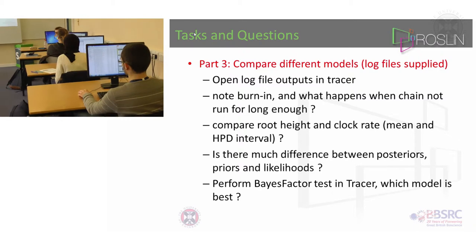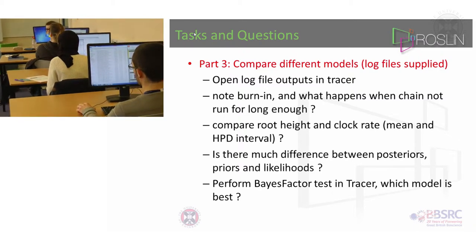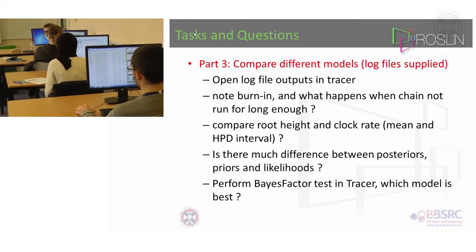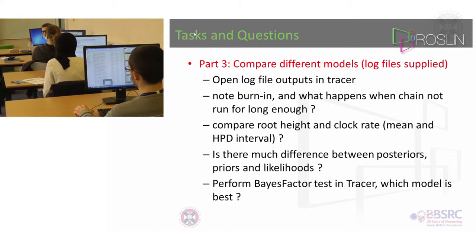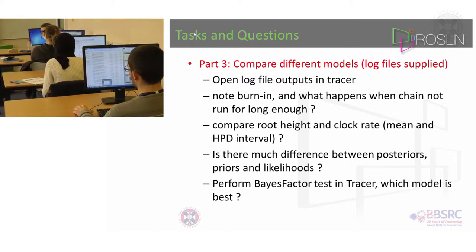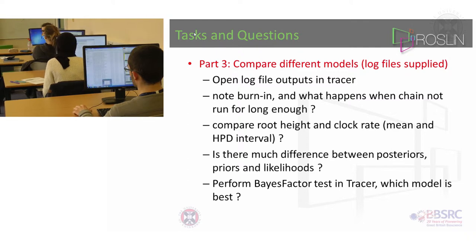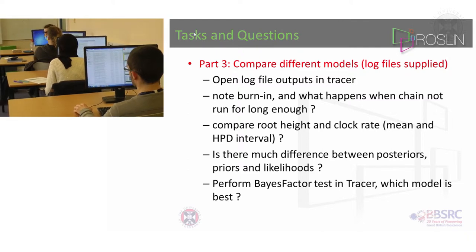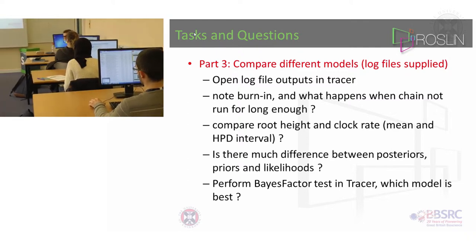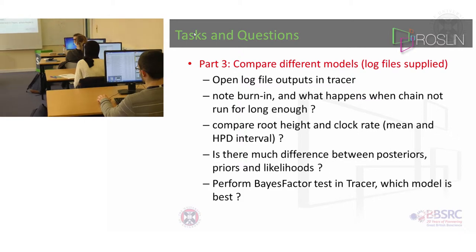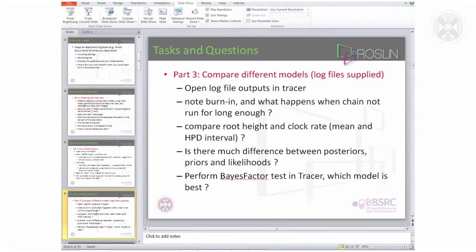When it runs then go to the animal bioscience directory and look in the runs for practical data and open them in Tracer. Let me show you Tracer.